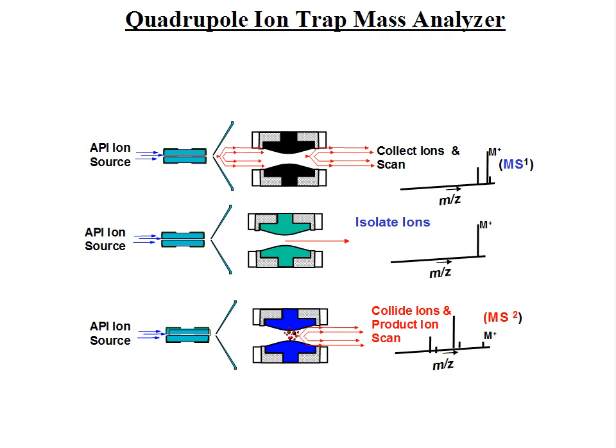The ion trap is thus a tandem mass spectrometer, as we call it, in time, because the events happen one after the other. A triple quadrupole or QTOF mass analyzer is a mass spectrometer that is tandem in space, because the mass analyzers are separated in space and one thing happens after the other in space.